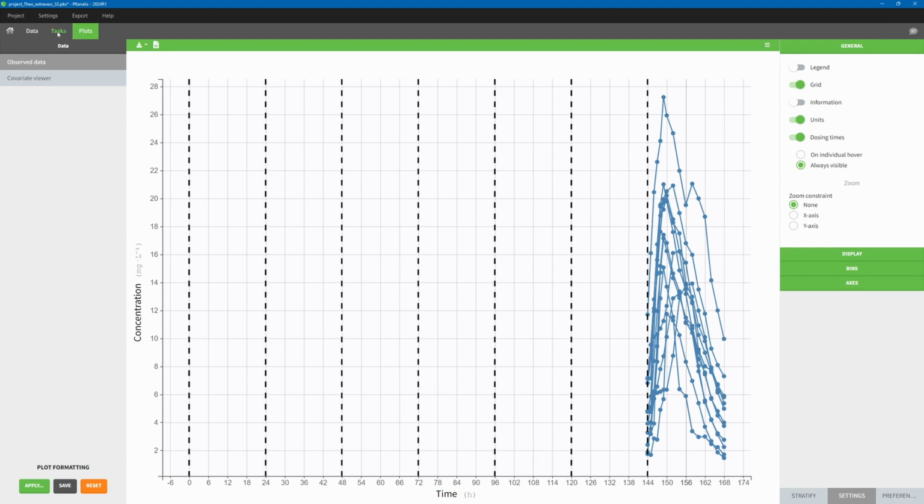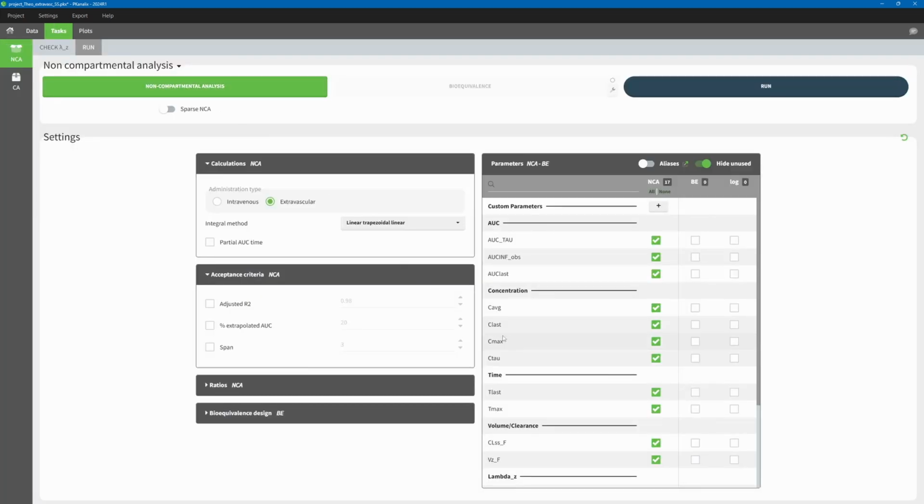We are interested in estimating the maximum concentration, Cmax, one would obtain after a single dose, but using the steady-state data we have. Note that the Cmax listed in the list of available parameters is the Cmax of the steady-state profiles. We would like to calculate a different Cmax.